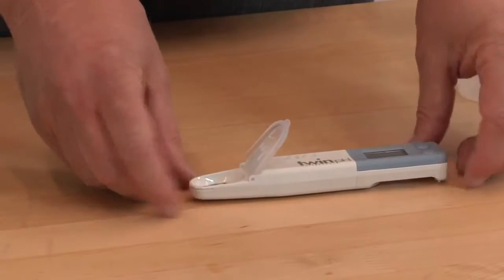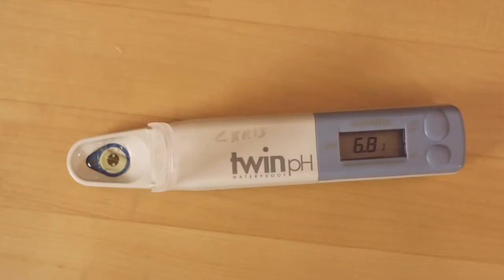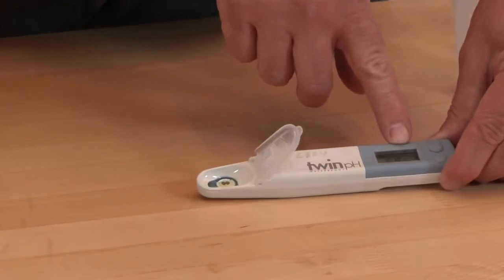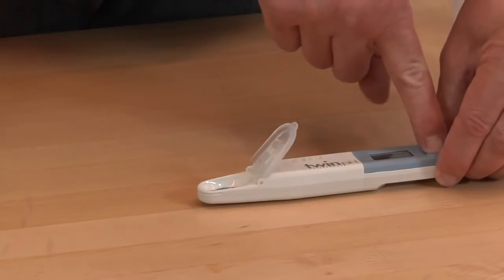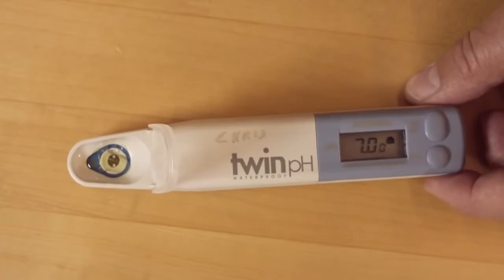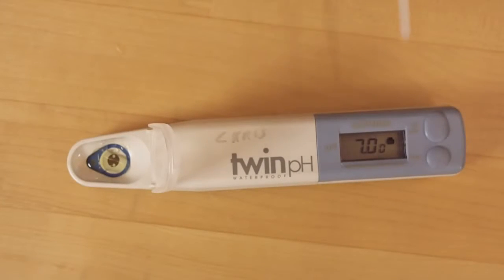So again, when we get a happy face, you can see that we're at 6.99. We want to calibrate to this, so we push the calibrate button. And you can see we're calibrating to 7.00. And we have that little symbol showing we're in calibration mode. Now we just wait for the happy face, and we've done our calibration to pH 7.